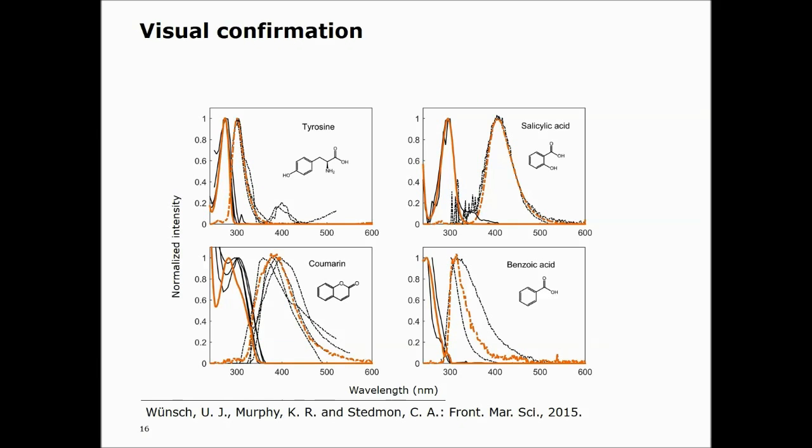They're quite similar, but if you consider the scale from 240 nanometers to 600 nanometers, there's quite substantial shifts going on between these components here. So yeah.